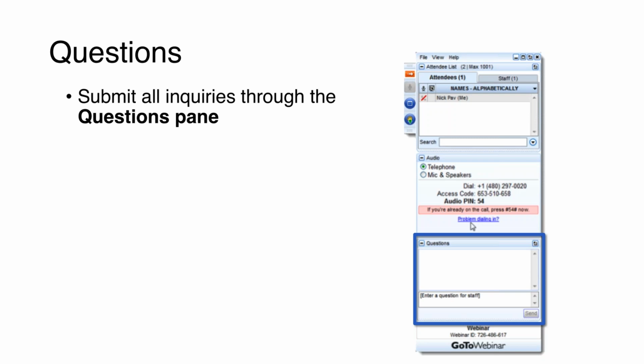Okay. And here's a more technical question to do with the K3. I'm not sure if it's Charlie or Corey who will respond, but what is the maximum continuous bandwidth of the K3 connection between the camera and the control computer? I guess I should take that one.